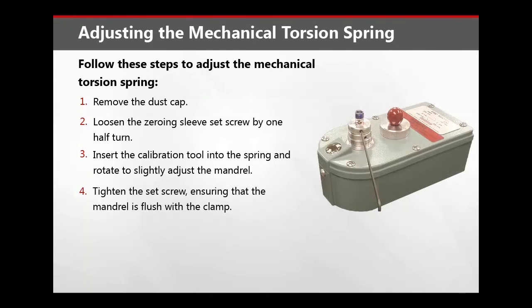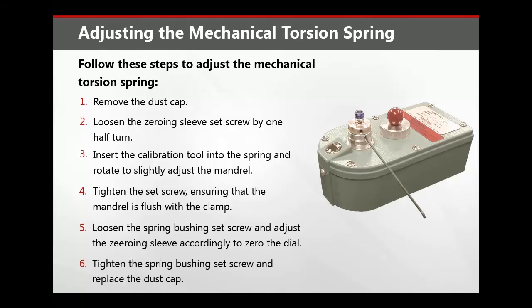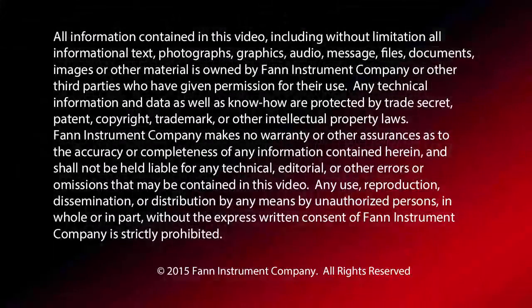Tighten the set screw and ensure that the mandrel is flush with the clamp. Loosen the spring bushing set screw and adjust the zeroing sleeve accordingly to zero the dial. Tighten the spring bushing set screw and replace the dust cap.